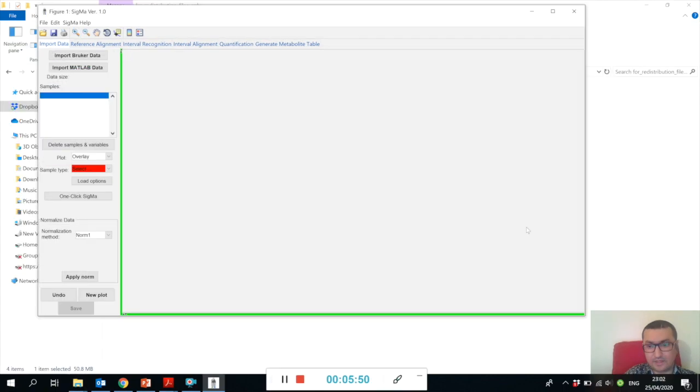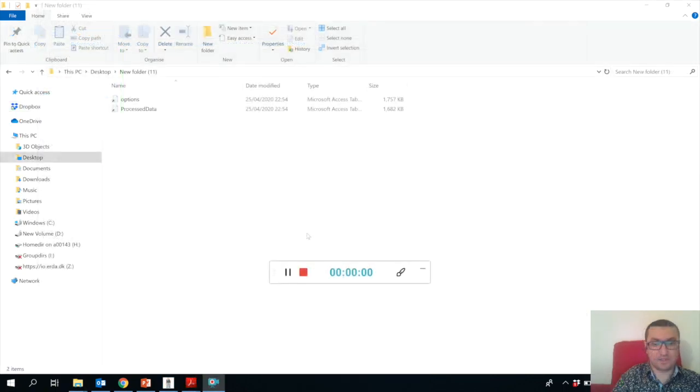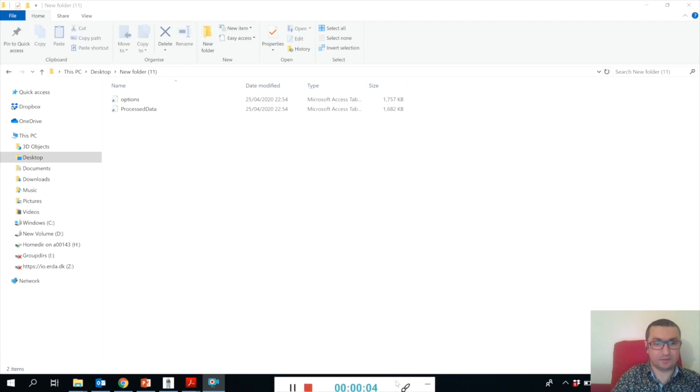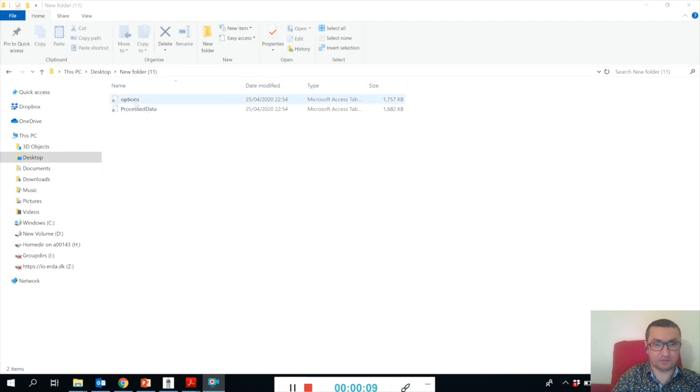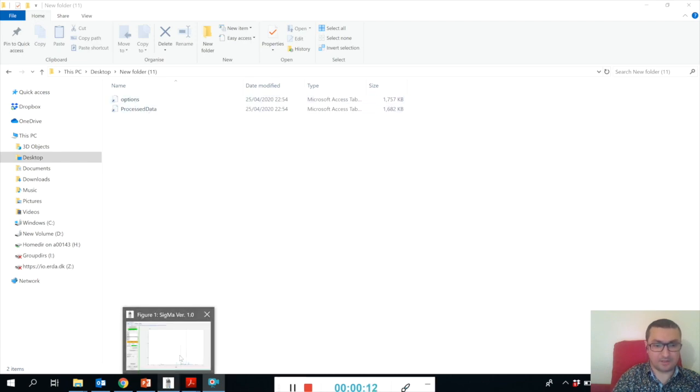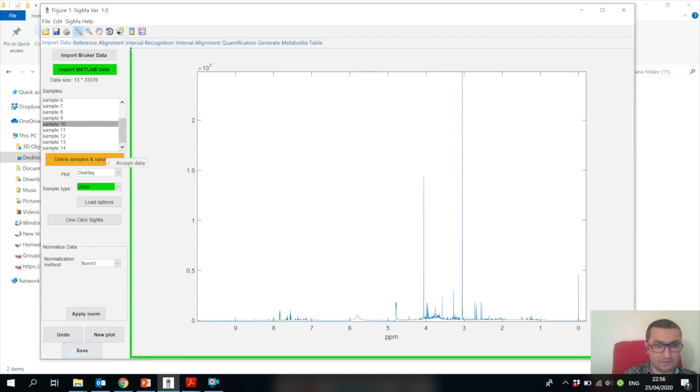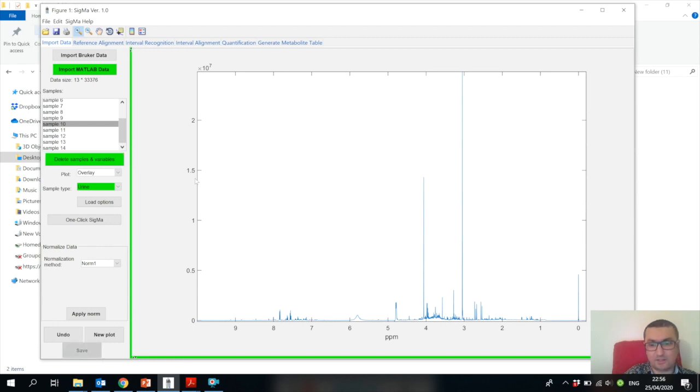It will ask where do we want to save this. Let's say we want to create a new folder - let's create New Folder 11. Now we have saved our data in New Folder 11.